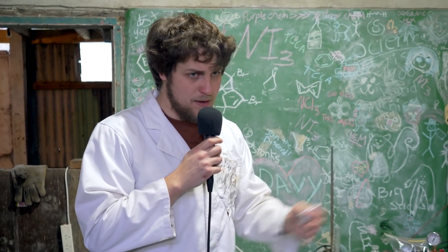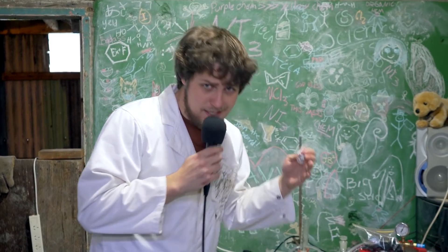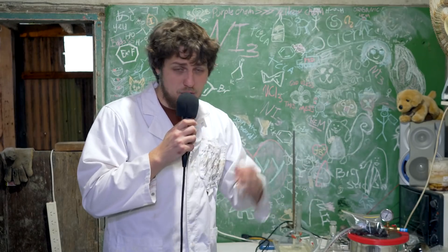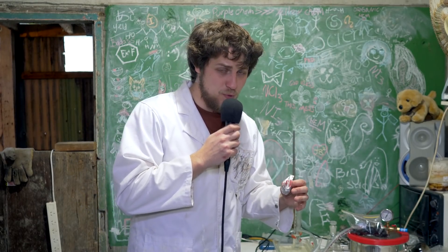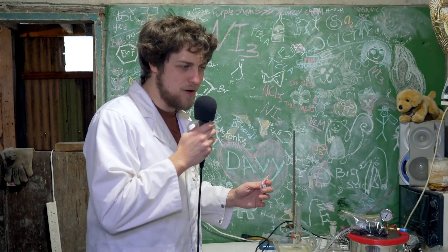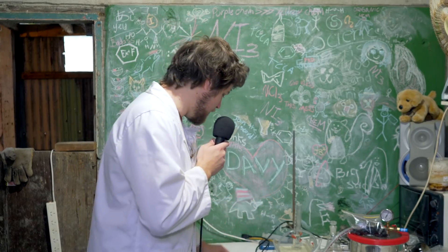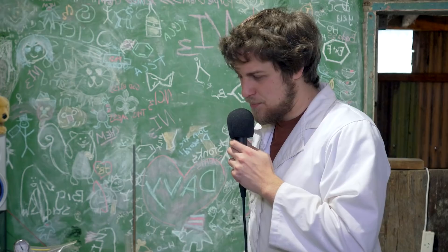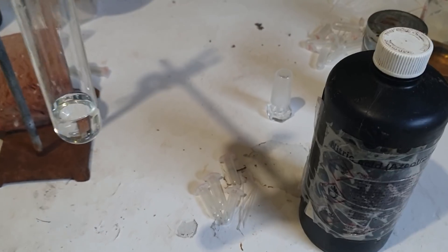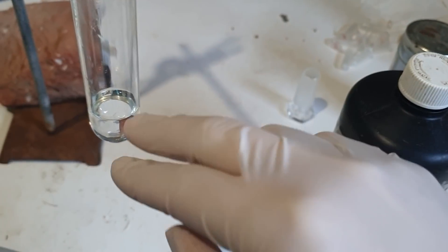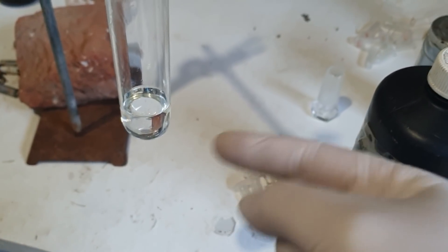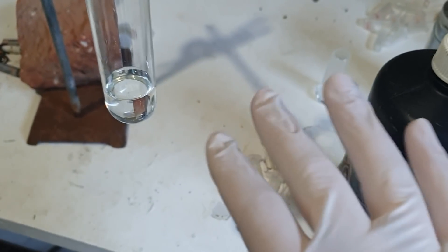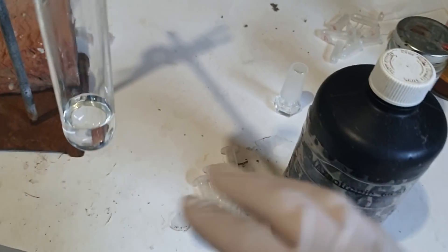I'm going to dissolve it up into solution with some nitric acid. I'm not sure how concentrated the nitric acid has to be before we get it into solution. And then we're going to try and precipitate out some ammonium perrhenate. I should have said that out loud before. I've just been reading it. I've never said perrhenate out loud before. It's a disgusting-sounding word. It looks really nice written, but saying it out loud, perrhenate. All right, so I've just got concentrated nitric acid in here. That's the azeotrope, so 70%. So I'm hoping that this will be concentrated enough to dissolve the rhenium. If not, we can use red fuming nitric acid, which is 100%. But hopefully the concentrated acid will be fine.